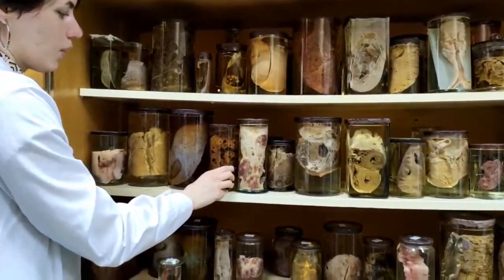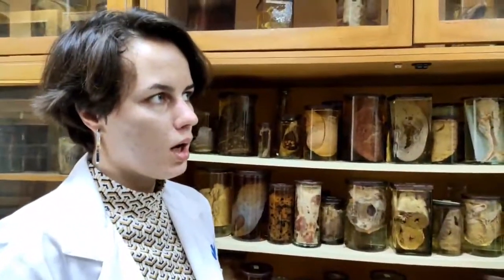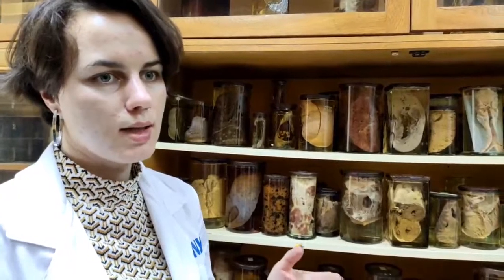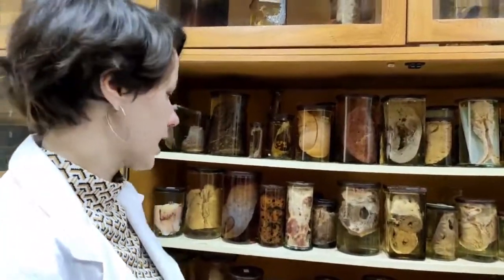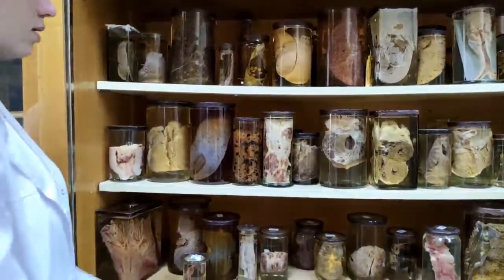Sometimes we don't see any color in metastasis of melanoma because when the tumor is malignant, that means that the cells lose differentiation and they can stop producing melanin because they lose this function. But sometimes we see this pigment, and in your specimen it's present.